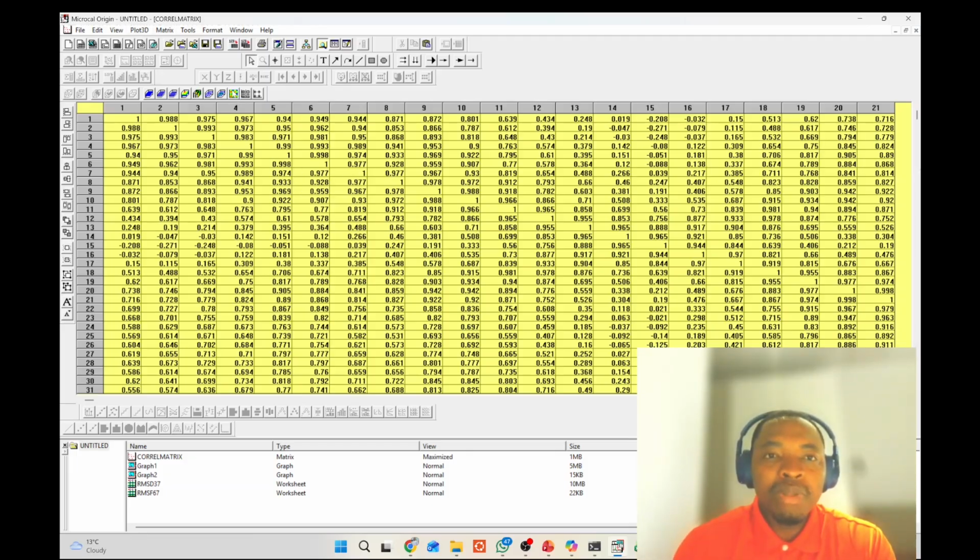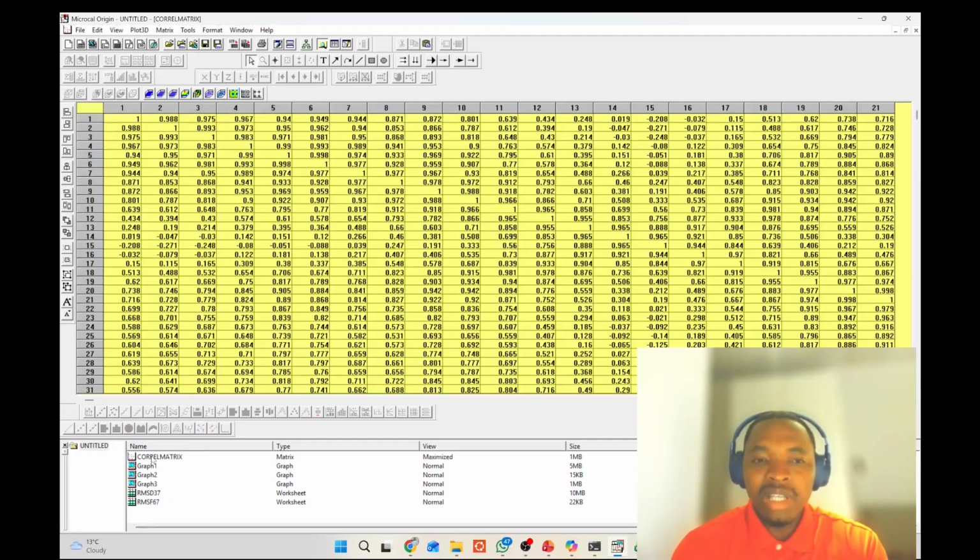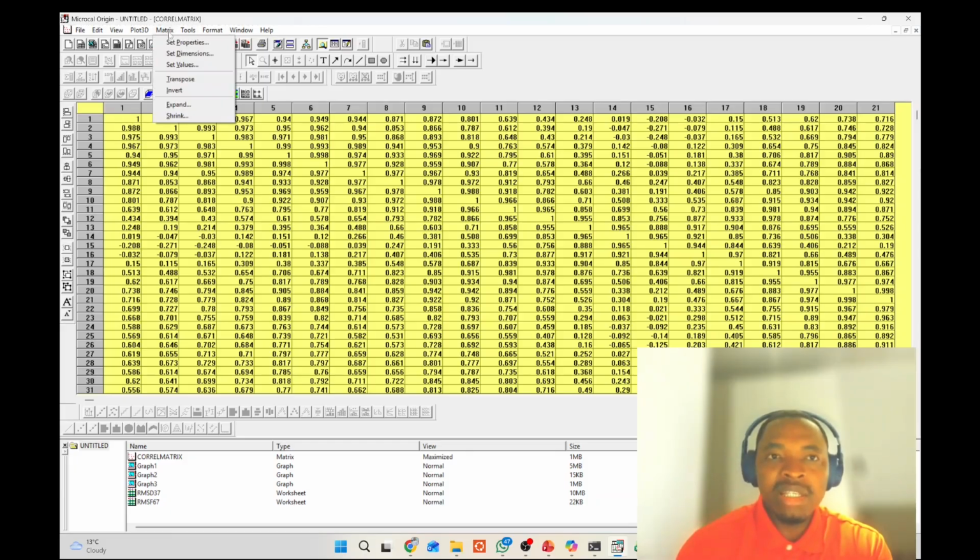So if I decide to plot a matrix, it's going to label it from 0 to 10. Meanwhile, this matrix is generated to account for all residues of the protein. So you see, it doesn't make sense. This protein is more than 10 residues. The reason is because it didn't adjust the size of the matrix with respect to the residue number. It just adjusted it with respect to a fixed factor. So we can actually correct for that by making edits.